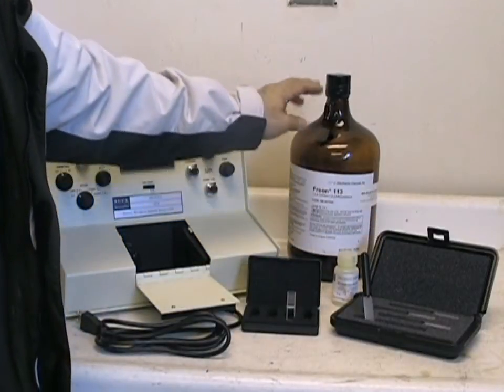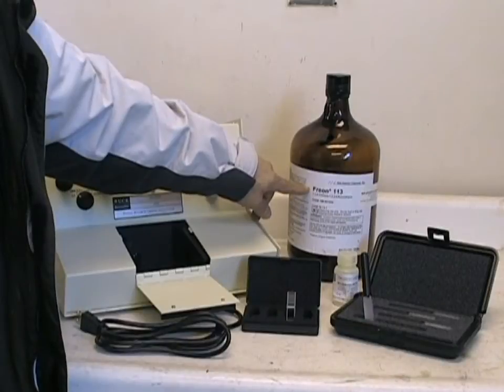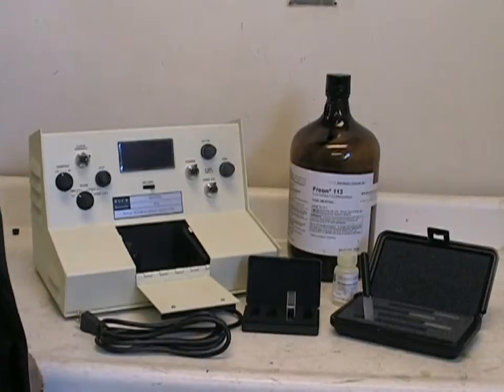It is recommended that a good infrared grade of freon 113 or carbon tetrachloride be used for the TPH and oil and grease measurements.